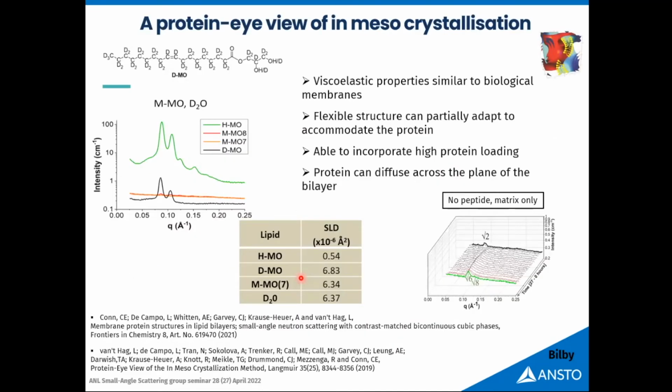This next one is a very complex project, but again, this is more a tick box for those who want to dig deeper, so look up those links if you're interested in this particular type of work. Liquid crystals are bread and butter for high resolution SANS. Again, those of you who work on SAXS, looking at those peaks, you might say, seriously, they're not well resolved. Again, for SANS, they are.